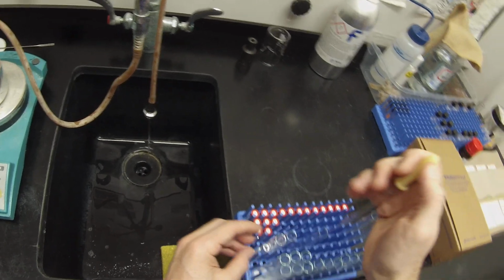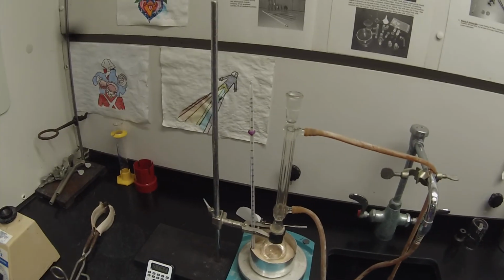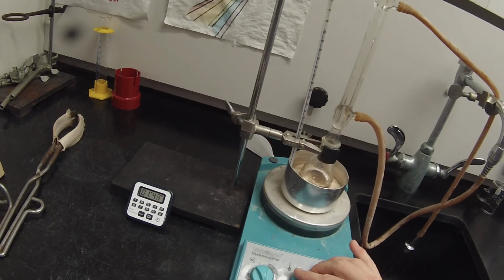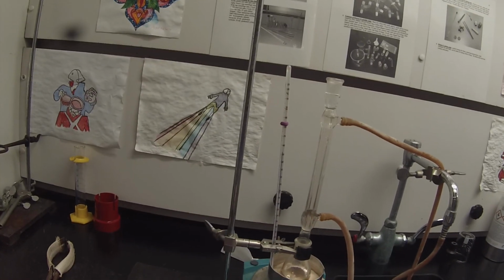And set that aside. So this is our T equals 1 minute. And we're going to take our first few at 2 minute intervals and then go to 5 minute intervals. So we'll have a 3 and a 5, and then we'll go to 5 minute intervals, and then 15 minute intervals after 30 minutes.